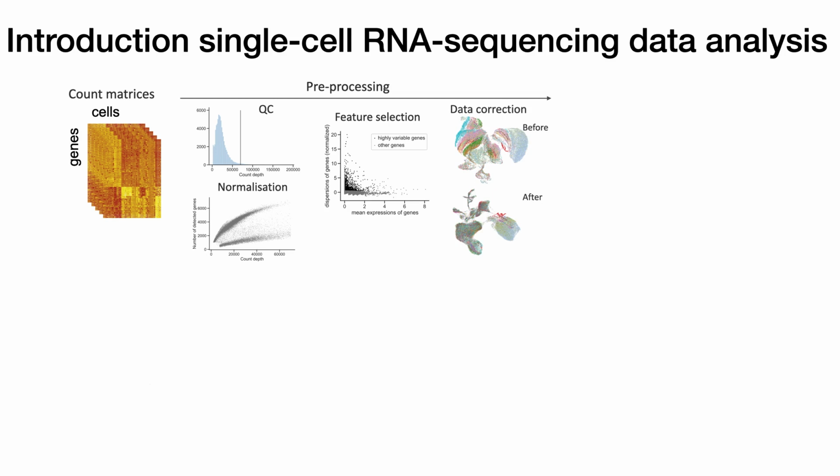Pre-processing takes usually 80% of your time, and all the rest of the workflow is about 20% of the time. So don't be scared if this pre-processing takes longer than you think.